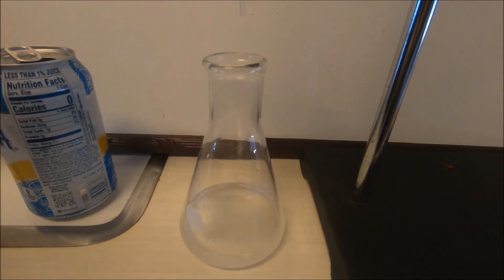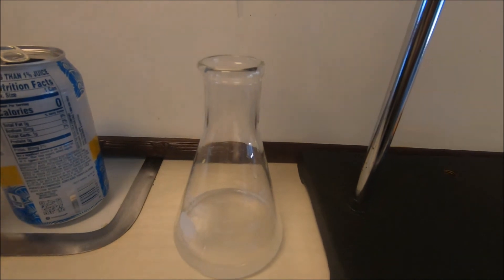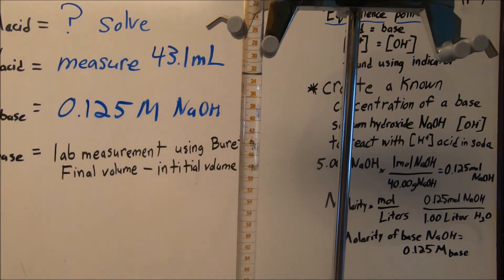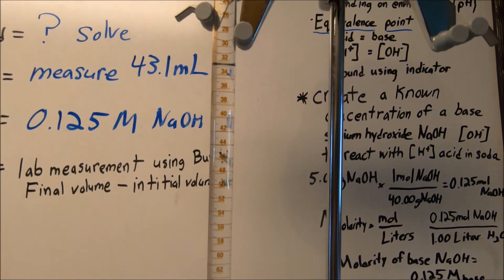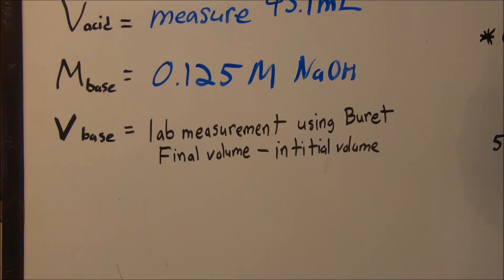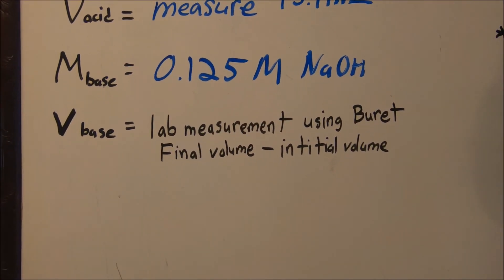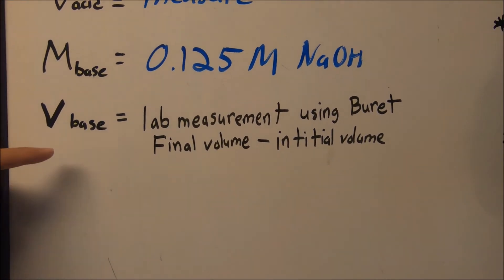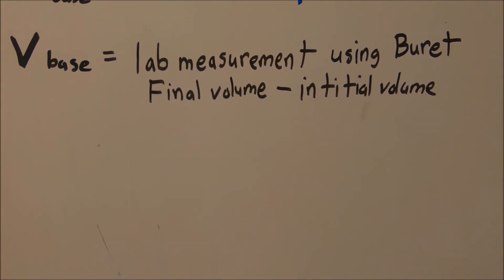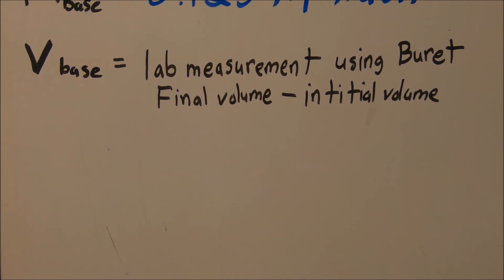We're going to add in the color indicator and start collecting some data, seeing how much volume we're actually going to collect. To calculate the volume of the base, this will be our lab measurement using the burette so we can get as accurate of a measurement as we can. That final volume minus the initial volume is going to be the total volume of the base that was used.